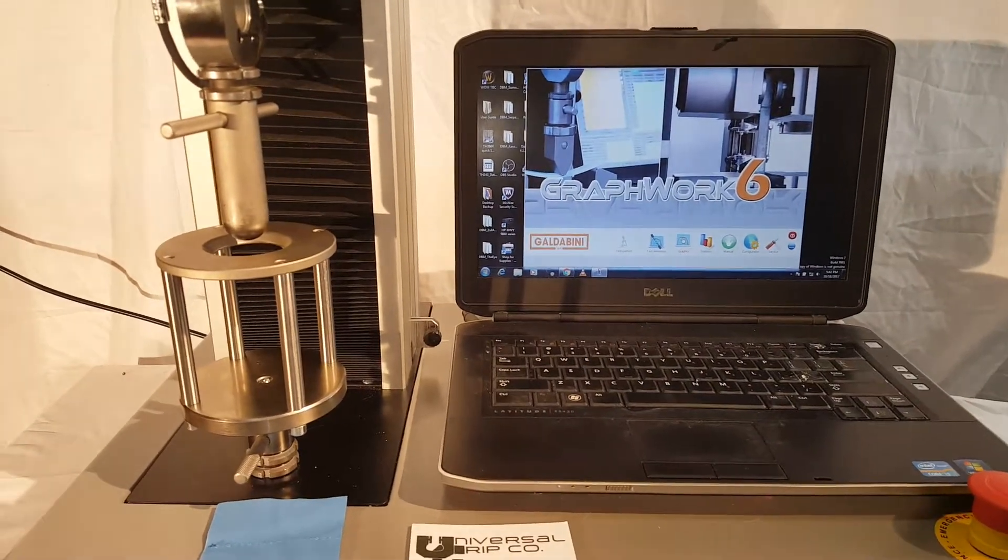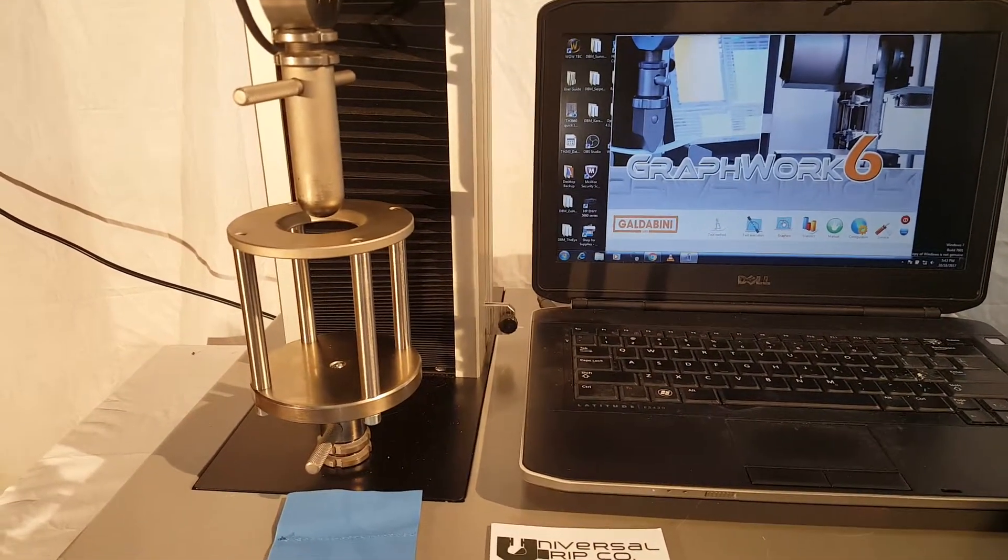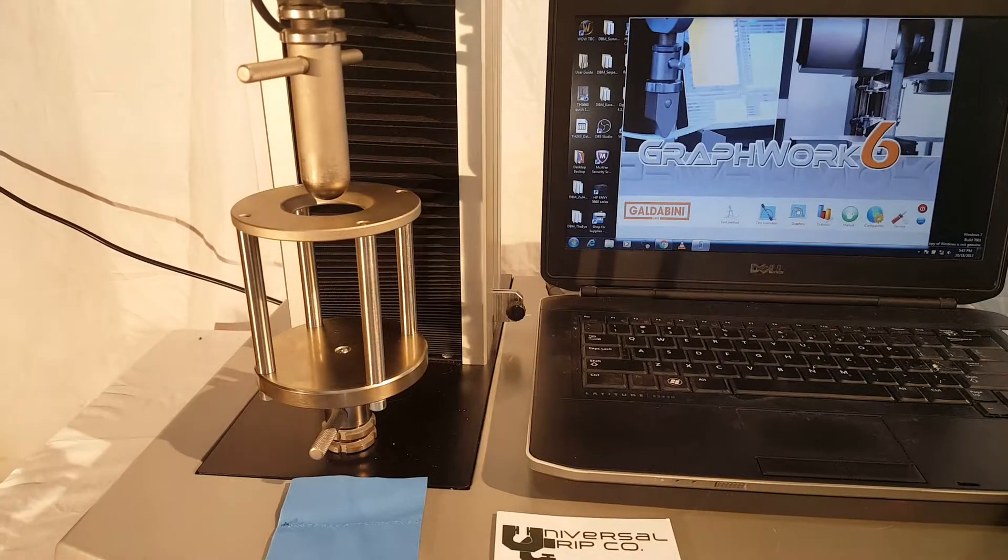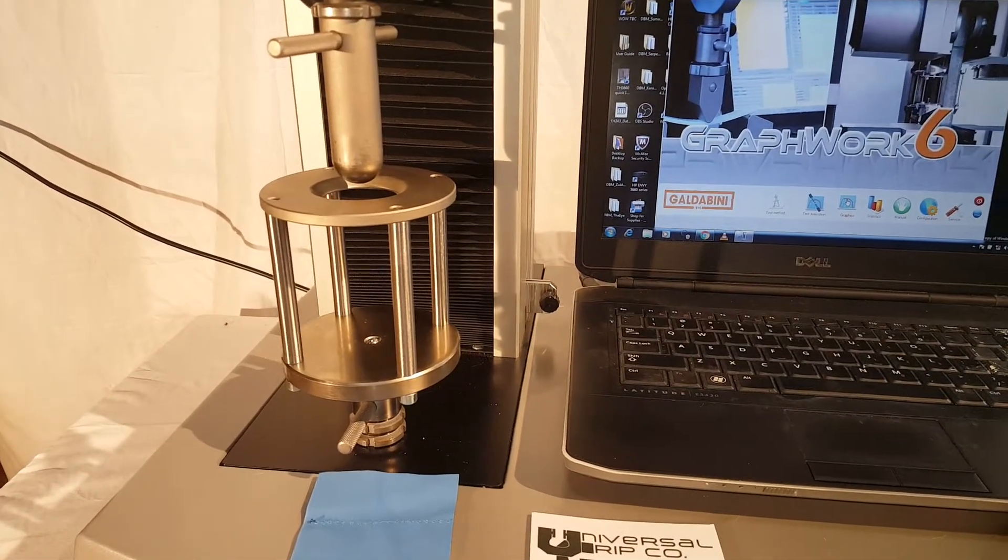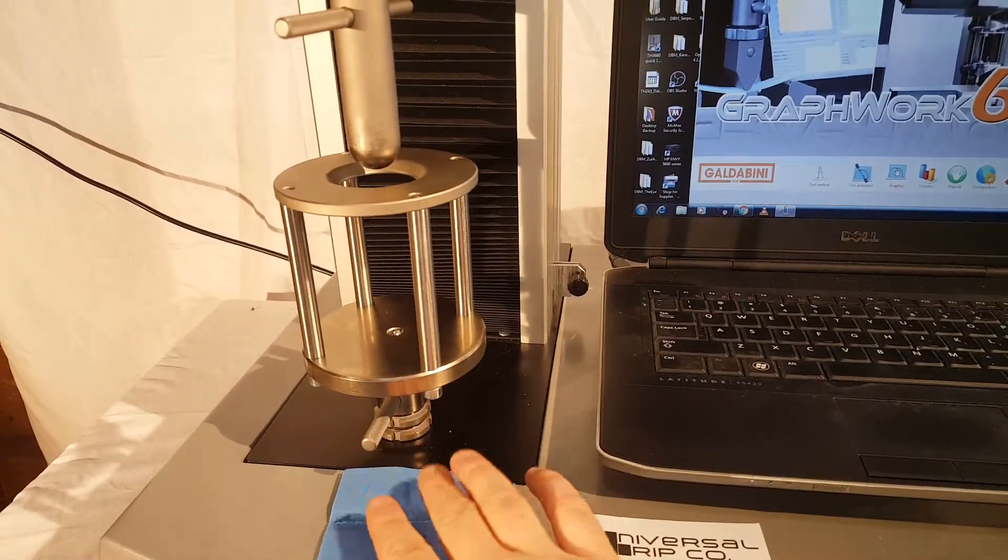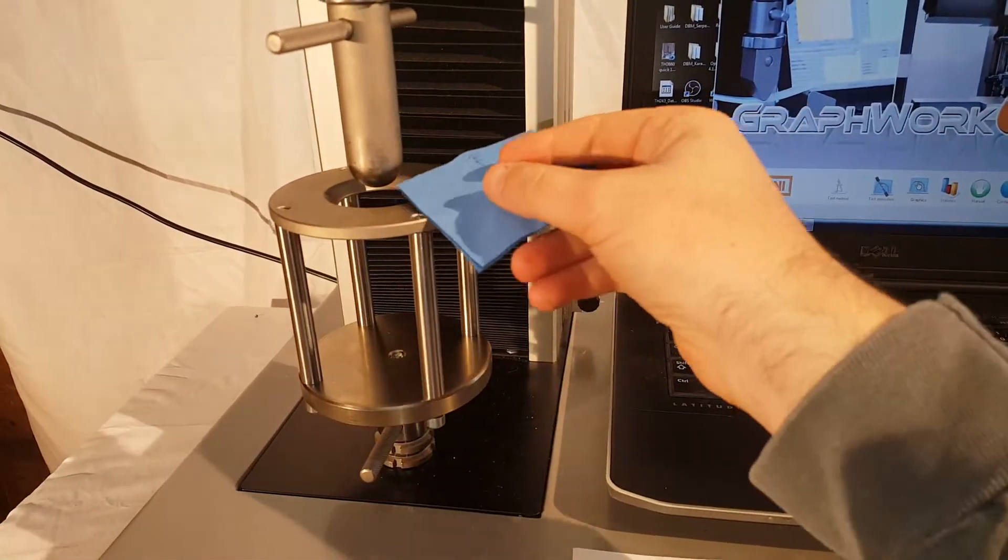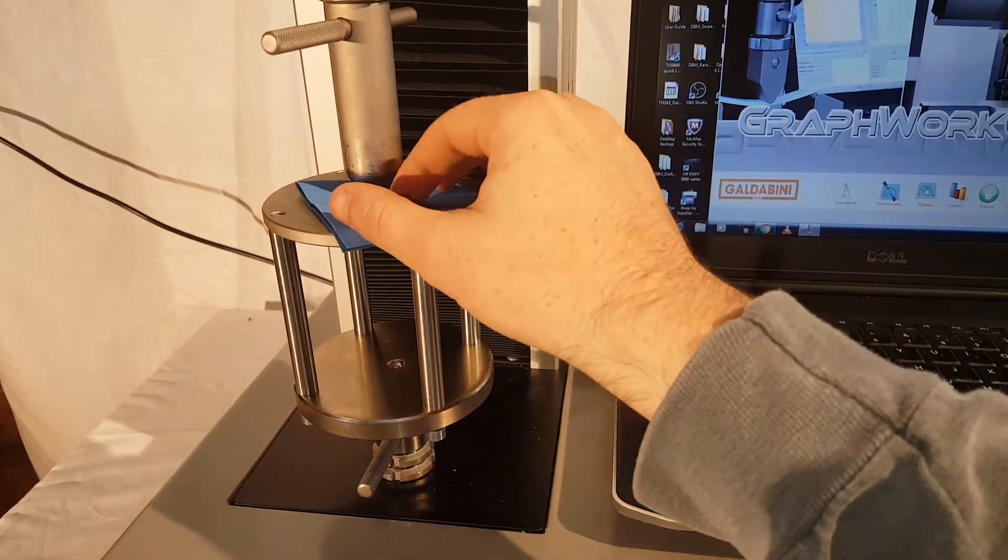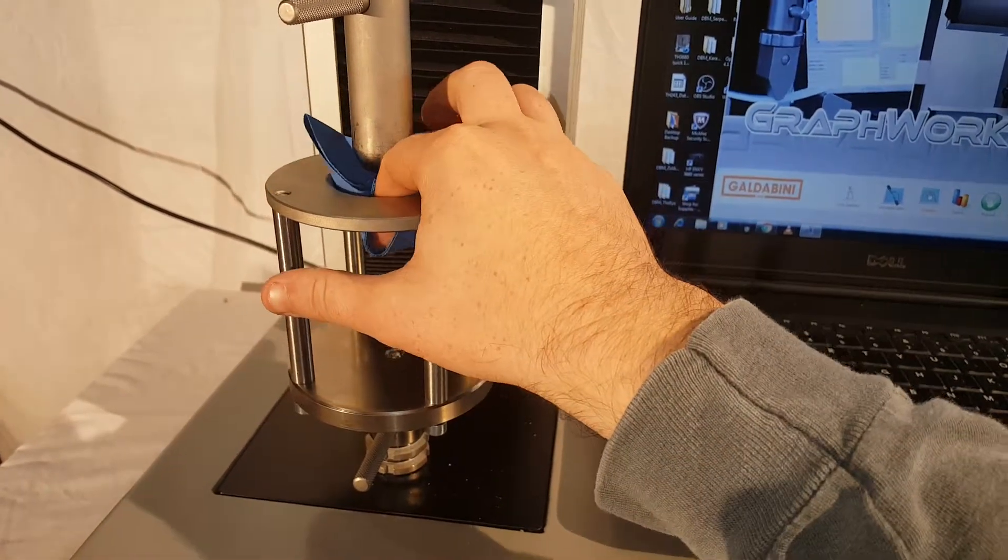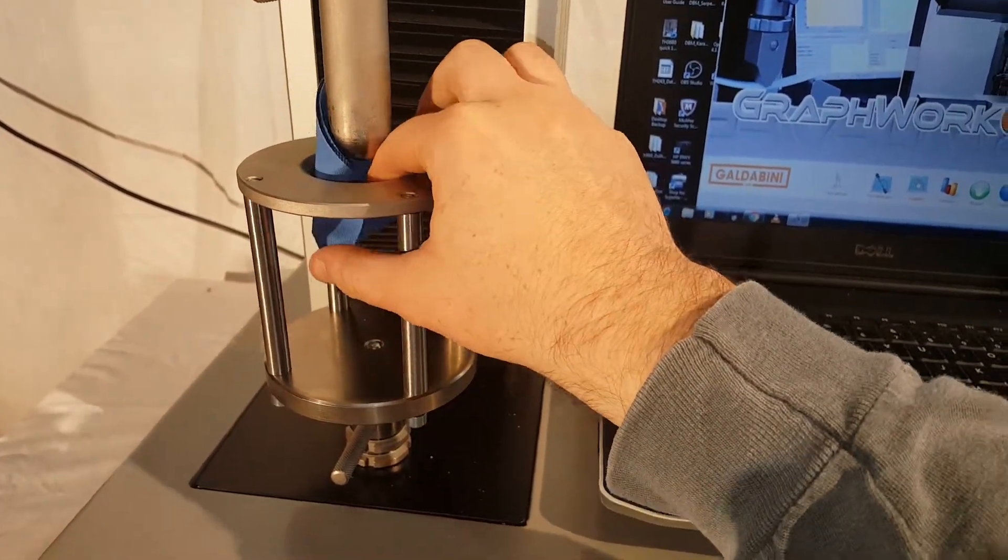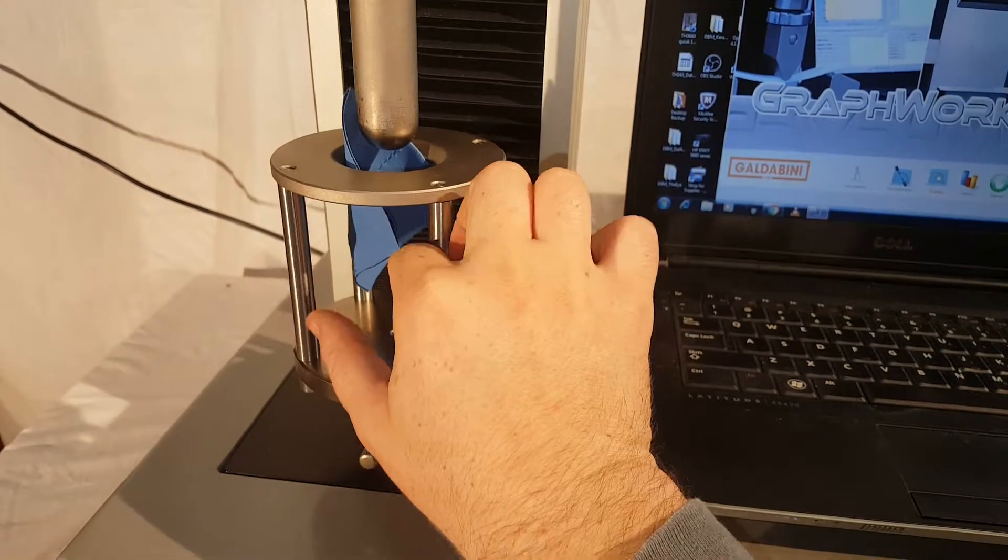Hello everyone. Today we are showing our ASTM D4032 fabric stiffness test fixture. This fixture works similar to a puncture fixture. Put a piece of fabric in and we're going to push it through this hole and measure the maximum load.